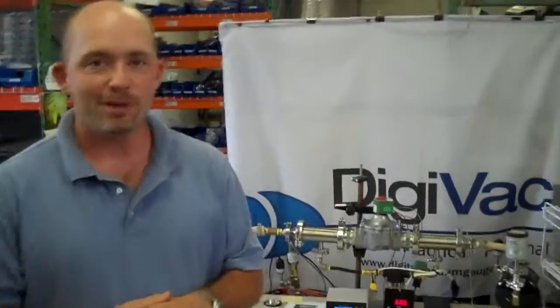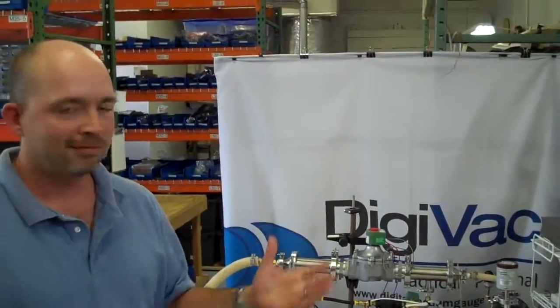What we've showed you is a custom example of some of the Digivac ingenuity as it applies to vacuum control, and specifically vacuum level control. We invite you to come and call us up and allow us to participate in your solution. Thank you and happy vacuuming.